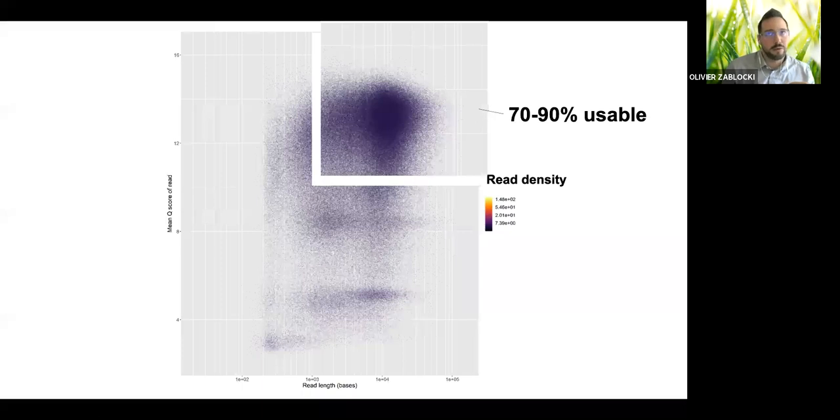So in this filtering process, you don't lose too much data. And again, as the tools get better, better data is generated in the first place, such that you don't have as much trash to remove downstream.